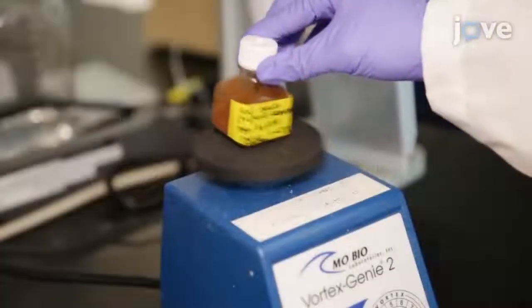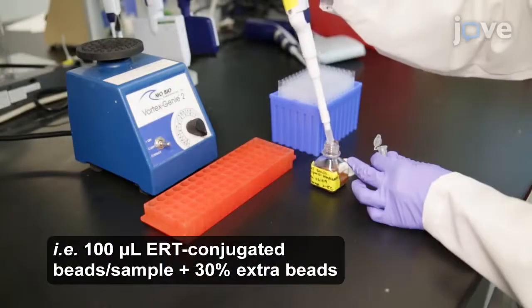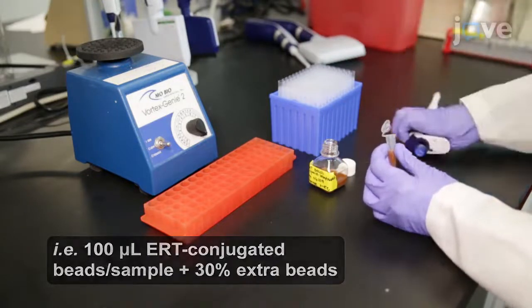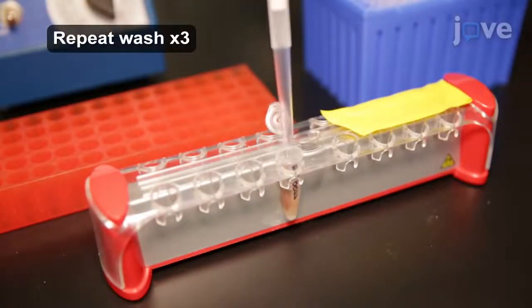For samples that have screened positive and need to be confirmed, vortex a vial of enzyme replacement therapy, or ERT, beads and add the appropriate number of beads to a 15-milliliter conical tube for another vortexing. Then place the tube in a magnetic tube rack for 2 minutes and carefully remove the supernatant.